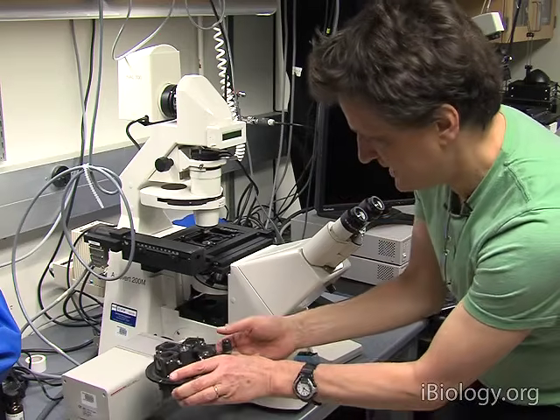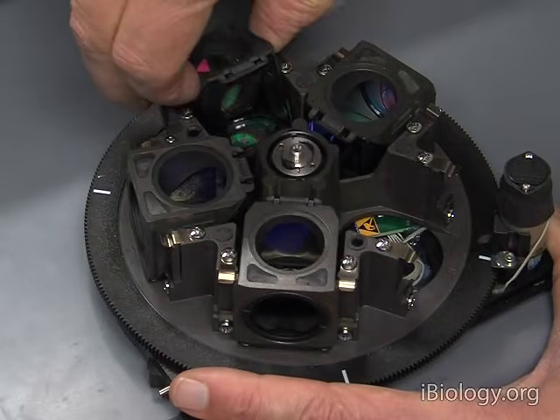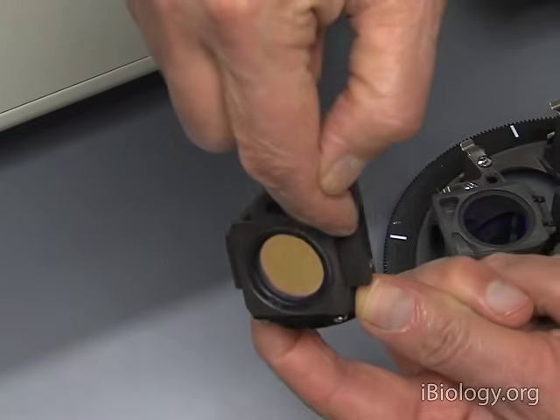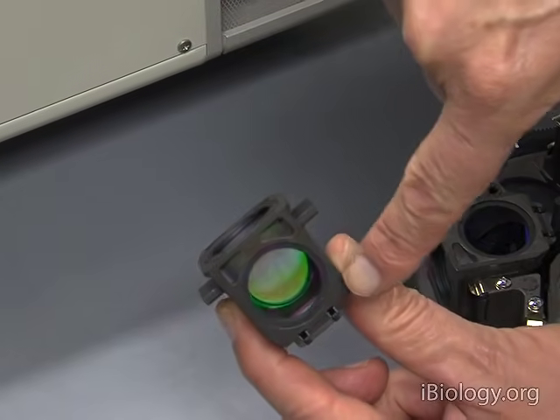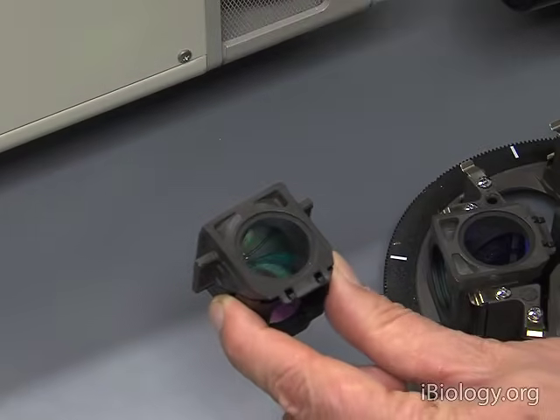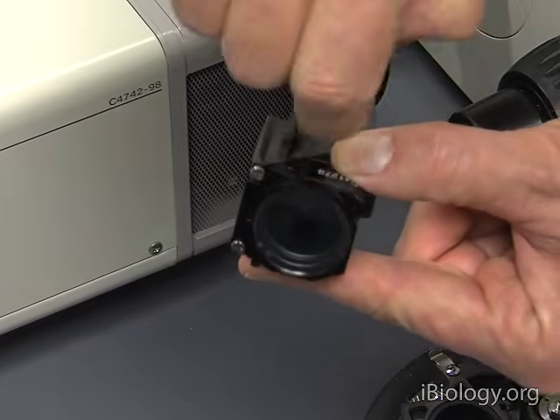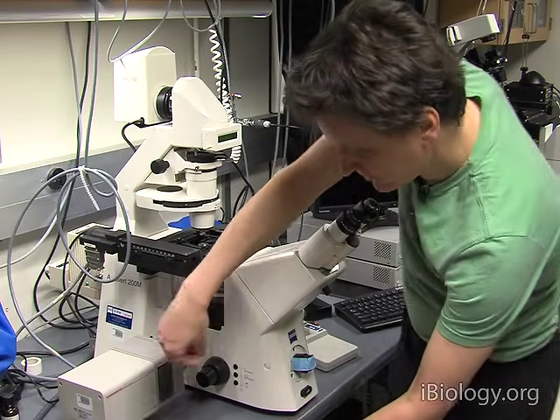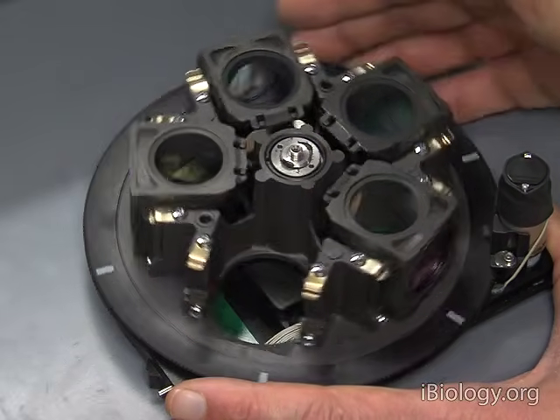So this one is sitting here. The light hits the excitation filter. I can take these cubes out like this. So the light hits the excitation filter. We're sitting in the microscope like this, goes through the excitation filter, hits the mirror, goes up, the fluorescence light comes back, makes its way through the mirror, and then here at the bottom we have the emission filter that goes down and in the end to the camera or the eyepiece. And now, since this thing is motorized, once it's sitting in the microscope, it can, with a push of the button, put in another of these filter cubes.